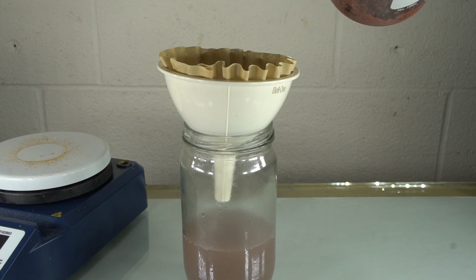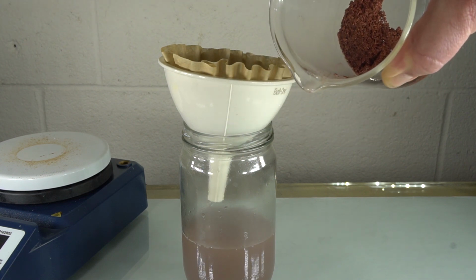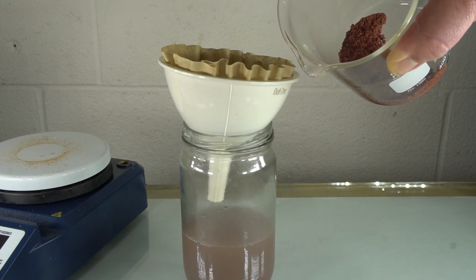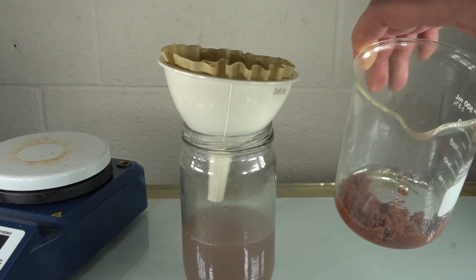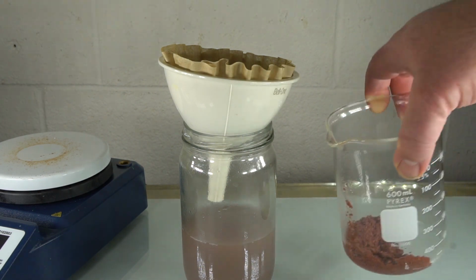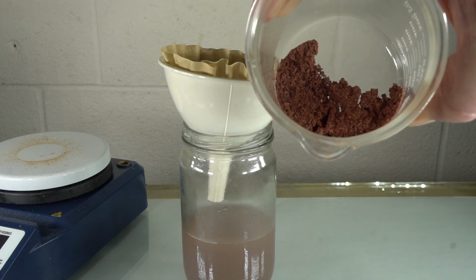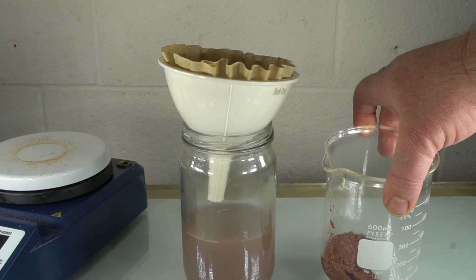So what I'm going to do is I'm going to actually scoop this out and dry it, and then let's take a look at it. So I want you to notice that the blue color is gone. All the copper ions are gone. Just another look. This is a really great amount of copper we got.